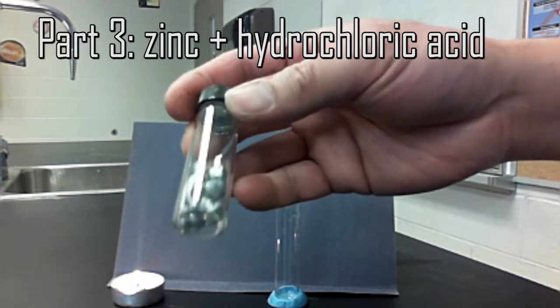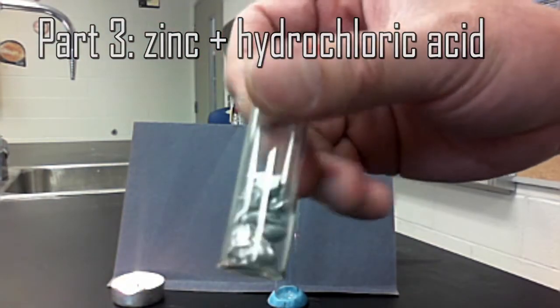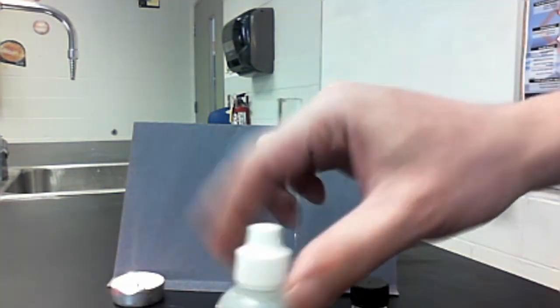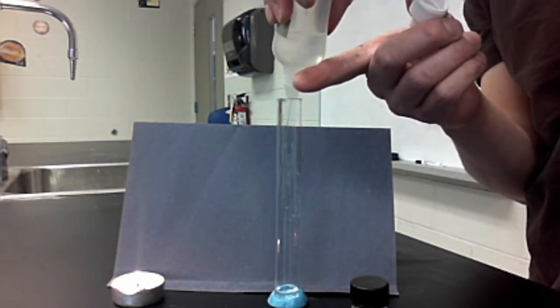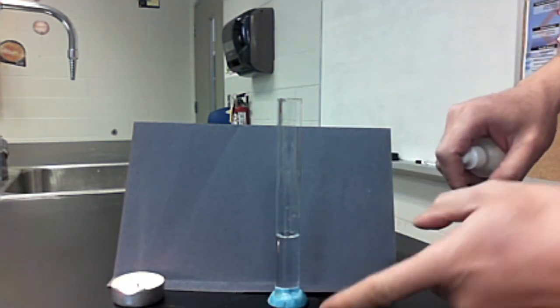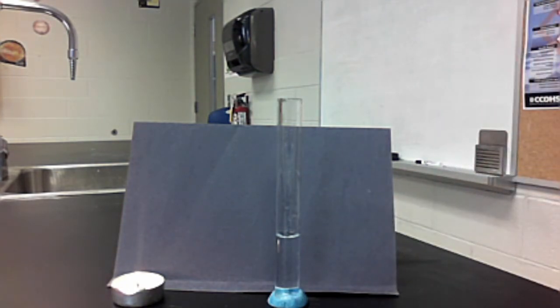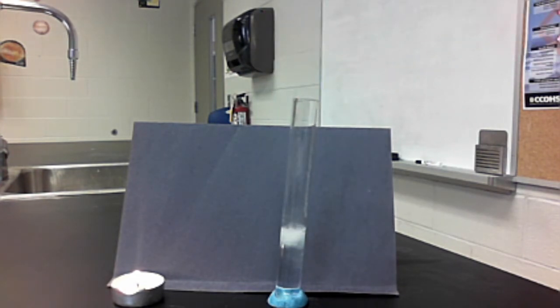What I have here is zinc. The way the zinc appears, it has a crystalline structure — this is known as mossy zinc. Mossy zinc is rather inert on its own, but you can place it into acid to see what happens. I have some hydrochloric acid here. We need about three milliliters of hydrochloric acid — you can approximate it by the number of finger-widths, so three stacks of fingers is approximately three milliliters.